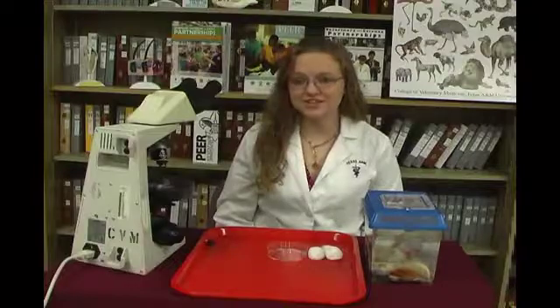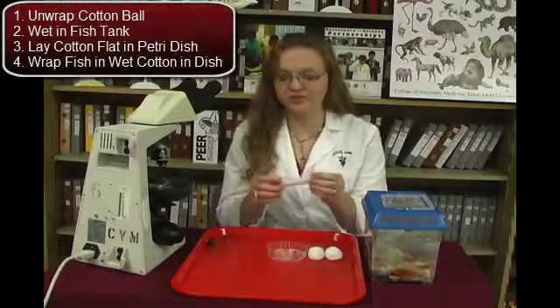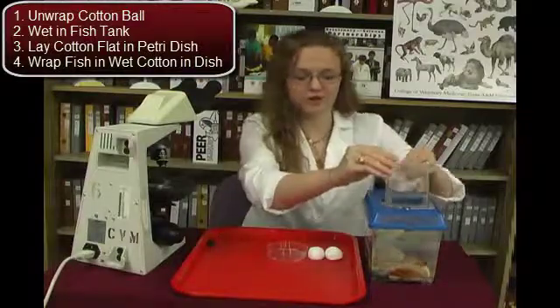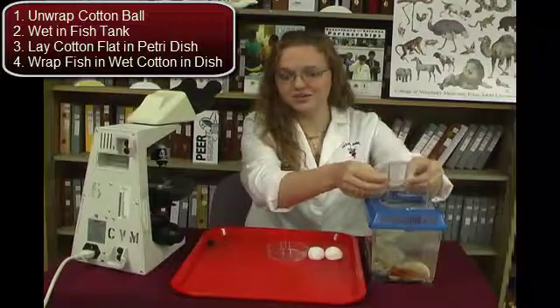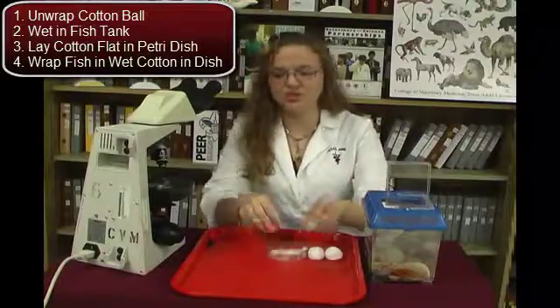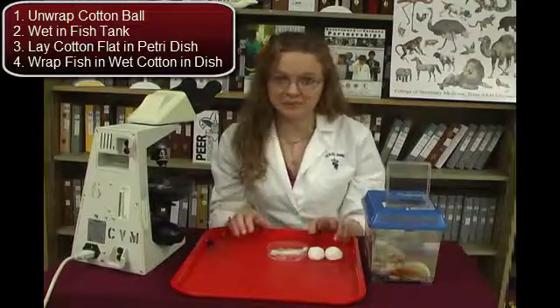To begin this activity, we will first start by unwrapping a cotton ball. We unroll it into a flat sheet and then wet it in the water from the fish bowl. While the cotton is still wet, we lay it flat in the petri dish so that we can now add a fish to the petri dish and gently wrap it in the cotton to keep it nice and wet.